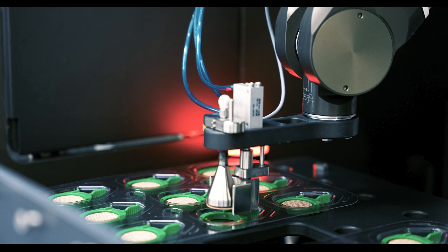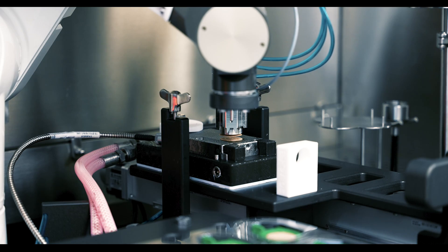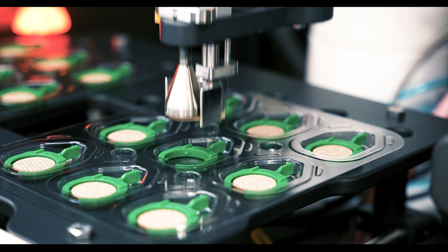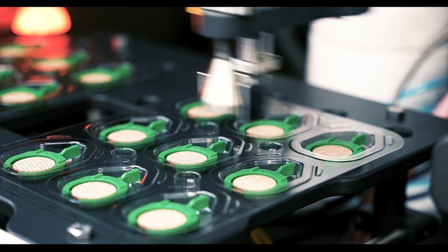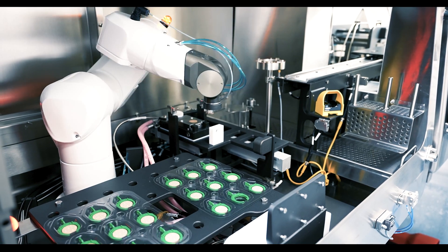After the trays are complete, they're passed manually to a conveying station which conveys them out of the coating cell to the next cell which performs a sealing operation.